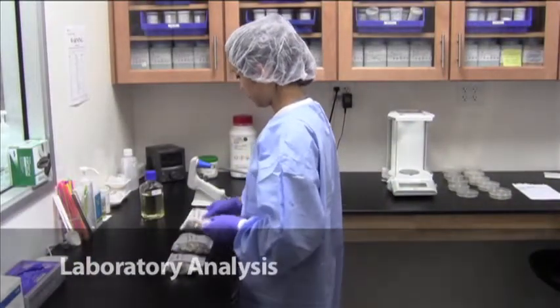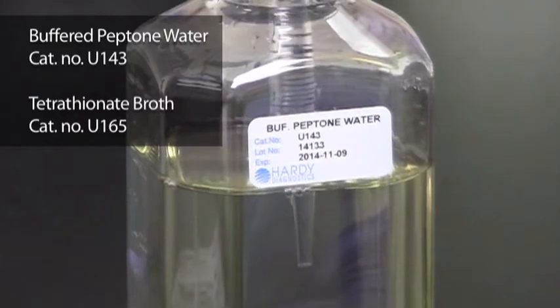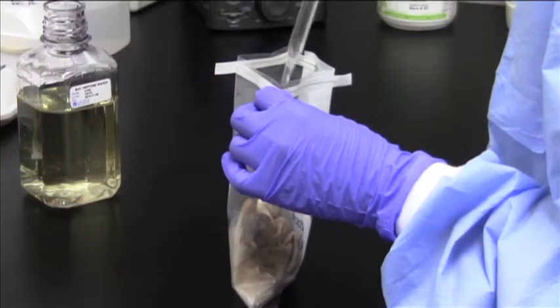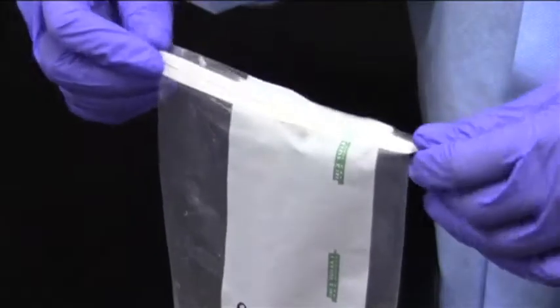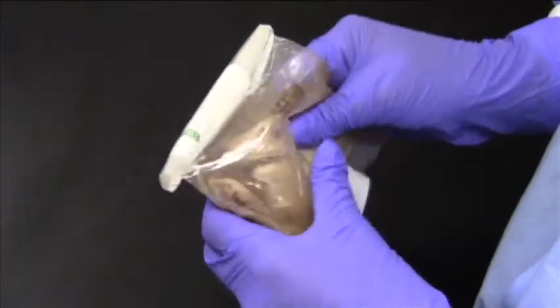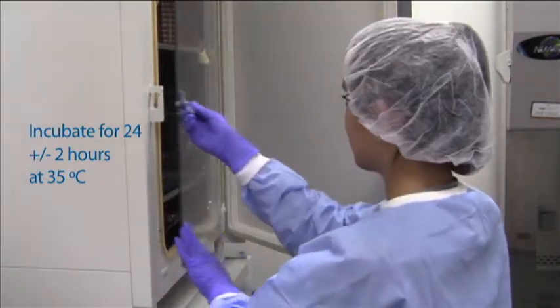Upon laboratory receipt, aseptically add pre-enriched media such as buffered peptone water or tetrathionate broth. Make sure the seal is completely closed on the sample bag, then massage the sample with the enriched broth to mix thoroughly.